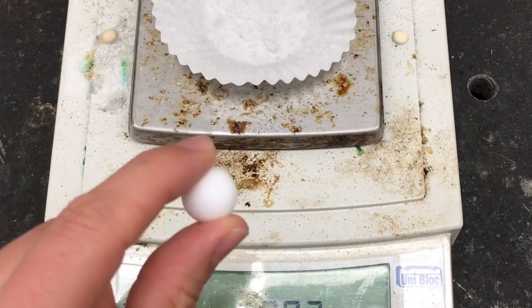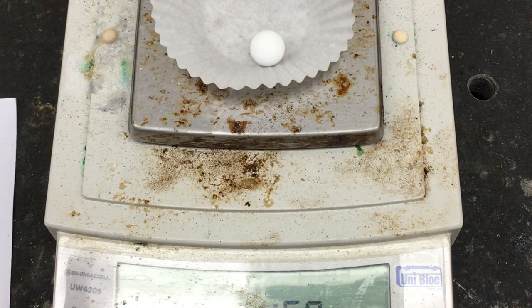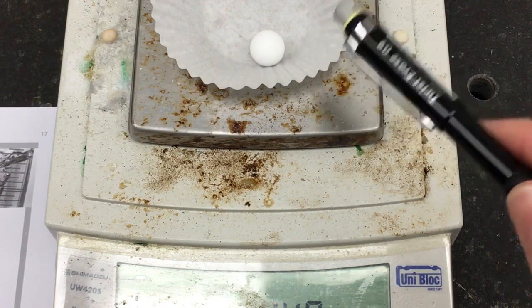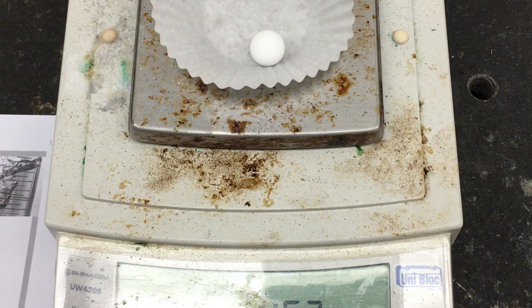So we have our Teflon ball. I'm going to just put it on the weigh boat. Okay. And then just give it some time. Let it equilibrate. Again, we're under a vent, so we have this kind of wind pushing down, and it's not great, but it's not terrible. So we are going to write down our mass. And the thing to remember is you want to make sure you do all of your experiments with that same one Teflon ball that you massed. You wouldn't just mass this one and say, oh, they all are going to have this mass.